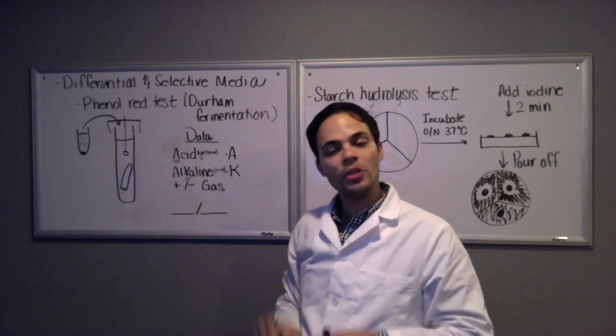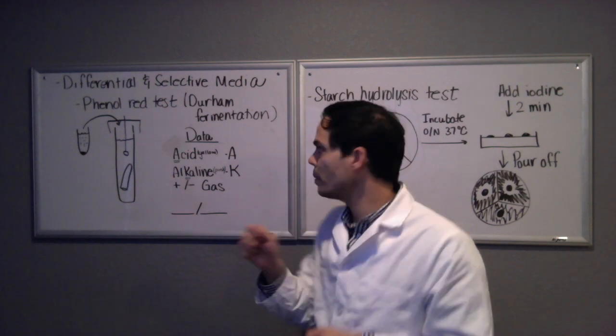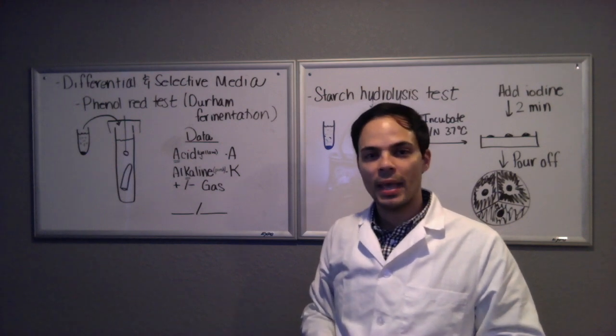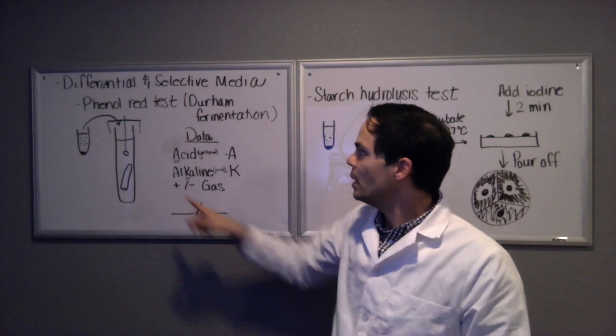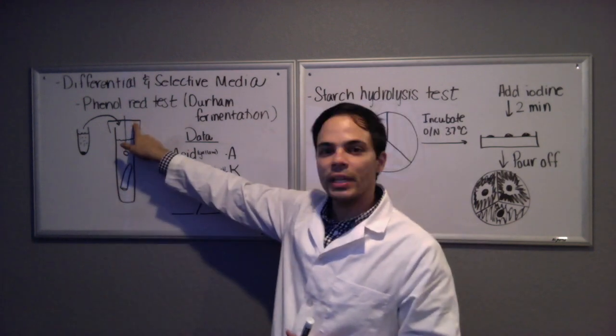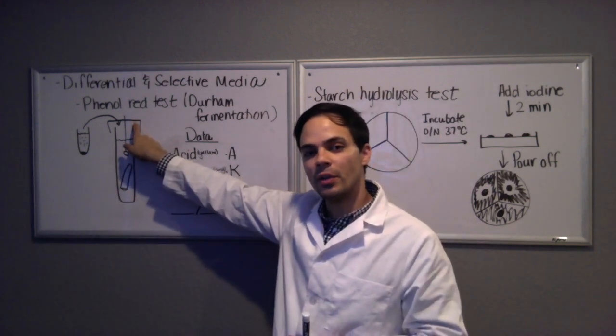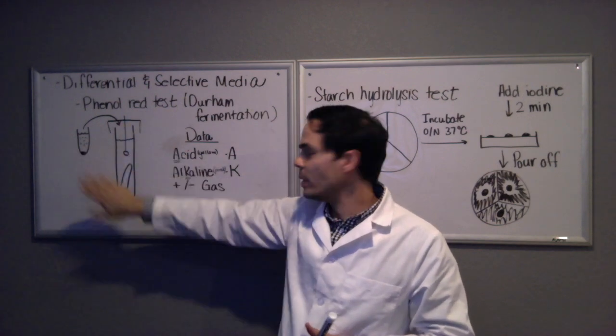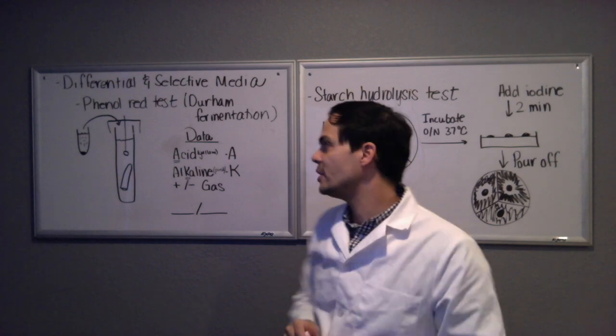When you label it, make sure you label the top here. You can use a piece of tape and if you do, make sure you dog ear the tape so it's easy to remove. You want to put your name, the date, the type of medium, and the name of the bacterium that you are inoculating with. Don't ever label the cap because if the cap should get separated from the base you will not know what's in that tube.